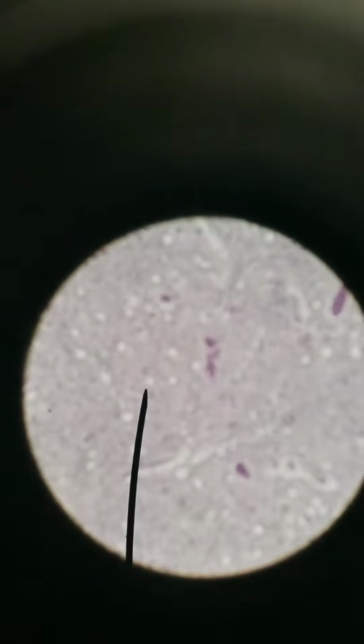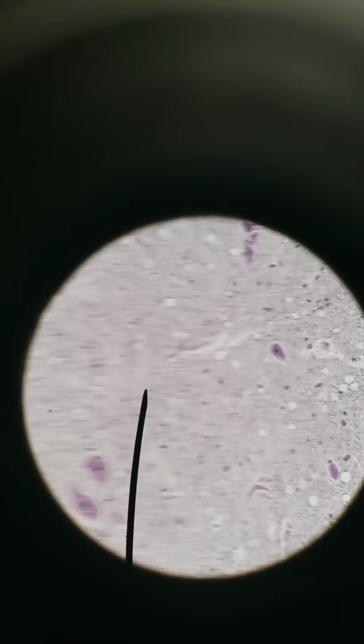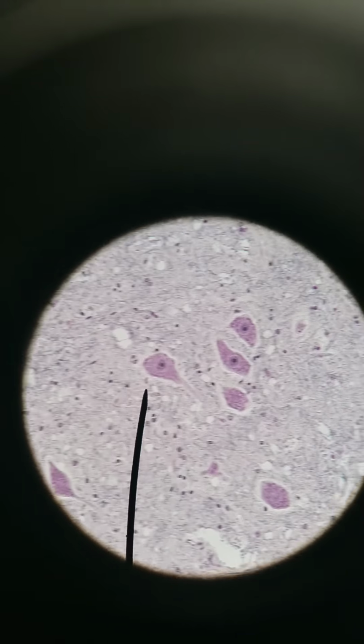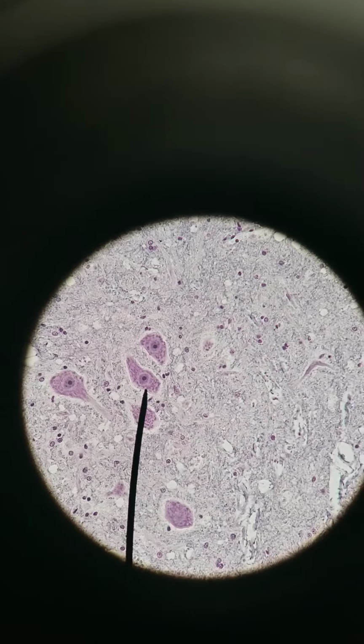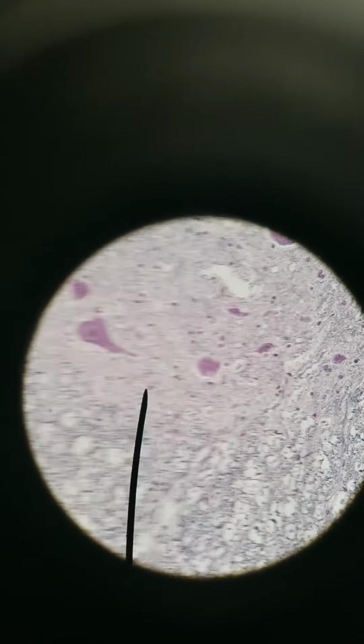You can see these dark stains in this gray matter. Those are the neurons. Let's zoom in and look more closely. On a previous video we saw a spinal cord smear. These are those same neurons but not smeared. They're actually within the tissue. So this is 400X. Here's the neuronal cell body. You've got glial cells, the smaller ones surrounding, likely astrocytes or oligodendrocytes. Can't tell from this stain, from this view. But all these larger ones, those are neuronal cell bodies of usually multipolar motor neurons.